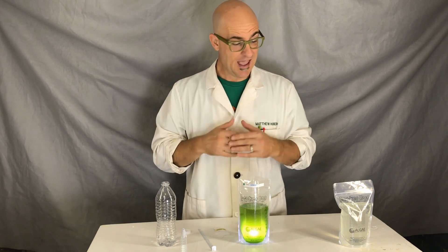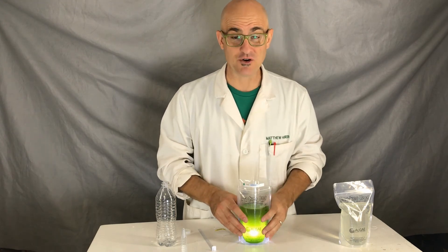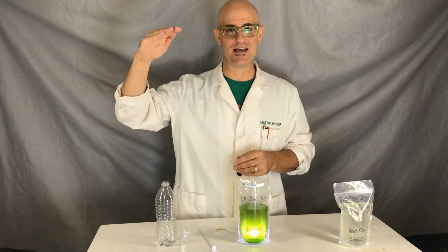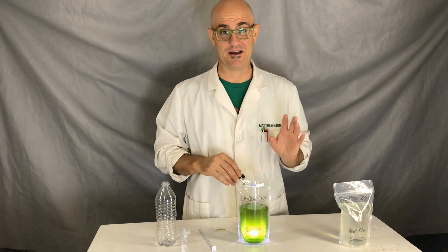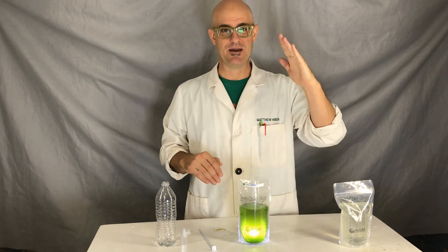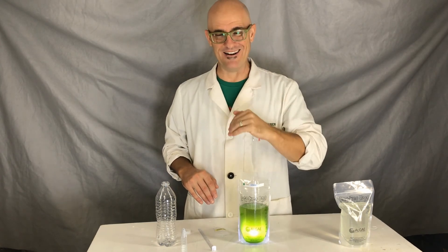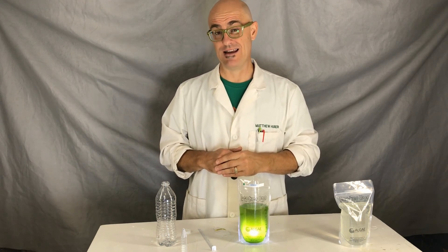Once you have the algae growing, the brine shrimp cysts will become more mature and start noshing down on the algae cells, and you'll find the algae biomass will probably come down a little bit. Nannochloropsis is a dynamo when it comes to growing, so there's going to be a balance between the growing of the algae and the grazing of the brine shrimp. It'll go up and down in a cycle — what we call predator-prey dynamics.